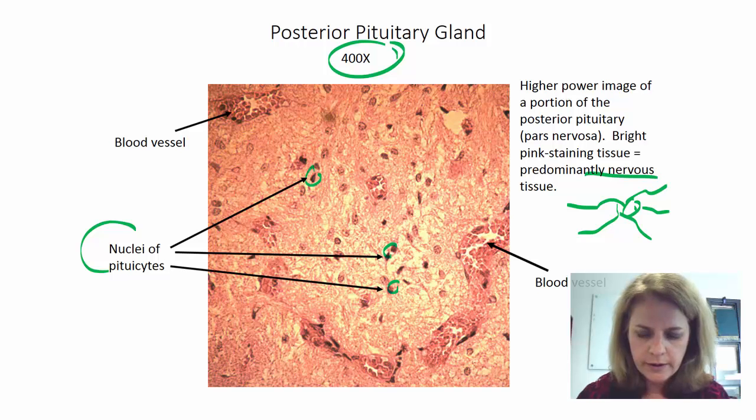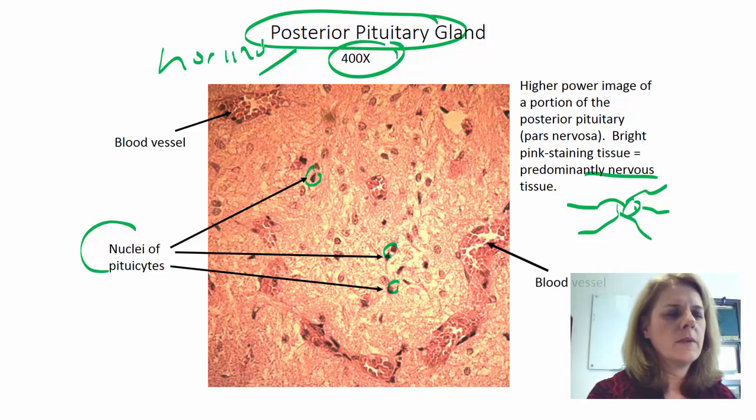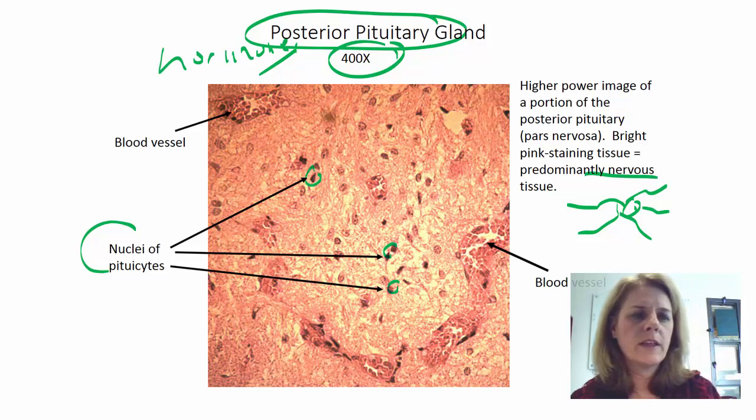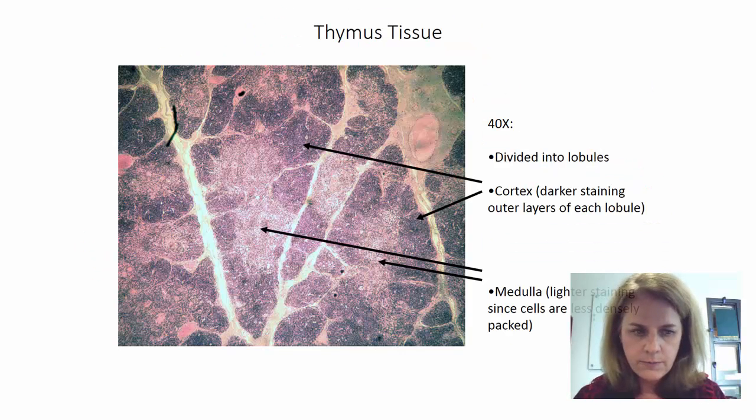Now, you've got to do the homework and figure out which hormones come from these glands. As I'm telling you where they are and what they look like, your job is to tie that to their particular hormones. You've got to figure out what hormone is coming from these glands, where it is going, and what it does. So you've got to be tying all this together.